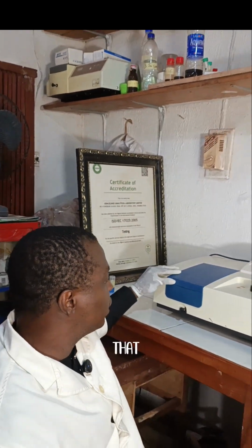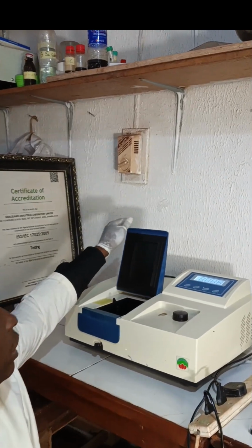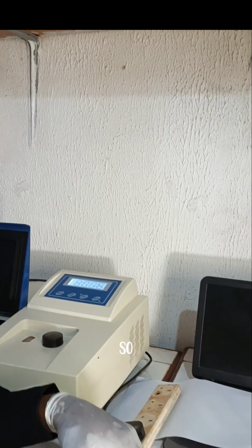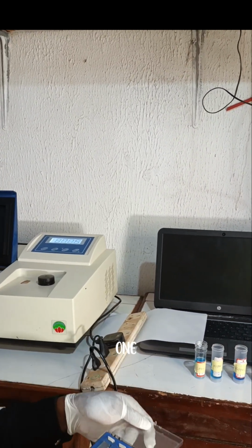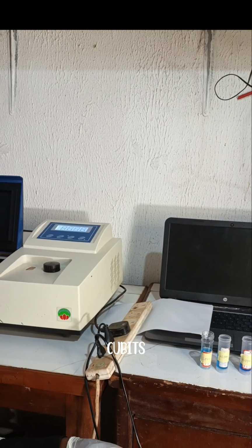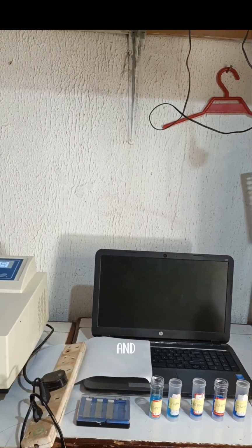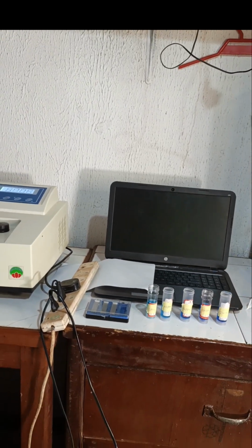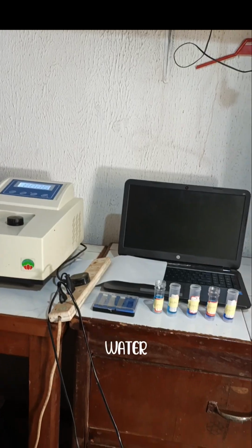Now, in order that we start, the first thing that we'll do is to zero the machine. That is bringing the machine to zero. So we have to first of all bring out one of the cuvettes and then rinse it with water. This is distilled water.